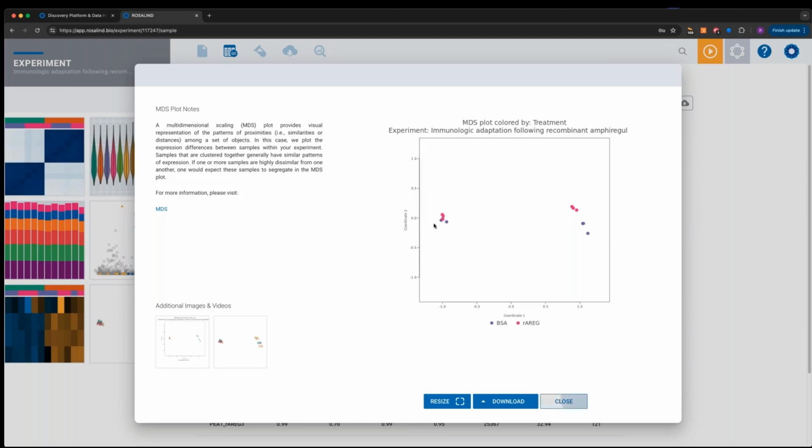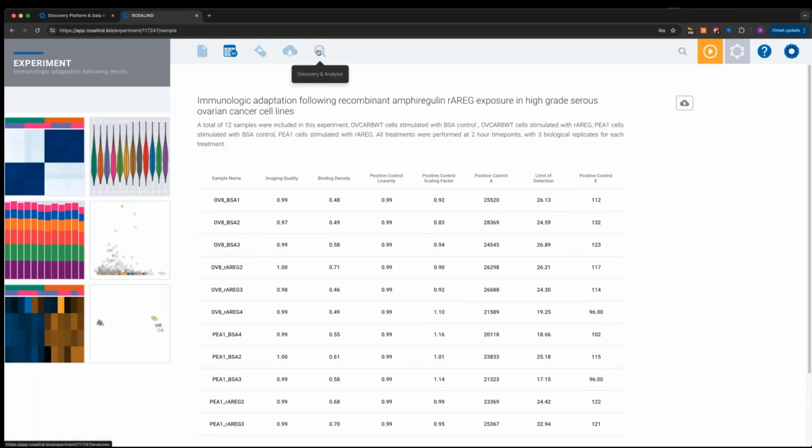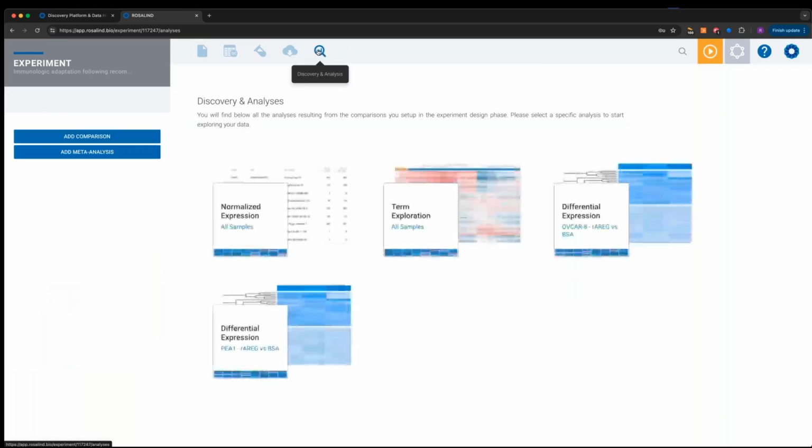Awesome. The next question was, thank you, Ryan, amazing presentation. It's very informative. Can Rosalind analyze RNA-seq data from the whole transcriptome atlas obtained with the GeoMx? And Ryan, the next question built on that from another person: can Rosalind work with DCC files? So these are obviously both related. Yes, this is a nice segue. So the answer is yes.